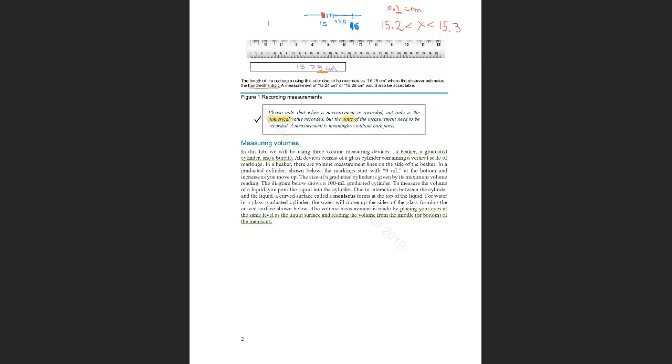If we start from the beginning, this is 1411, and we start getting the correct habits, it will help us along the way, not only with other chemistry, in work, you never know if you're working in a lab. So what they are reminding us is that when we do a measurement, we have to record the numerical value and the units.